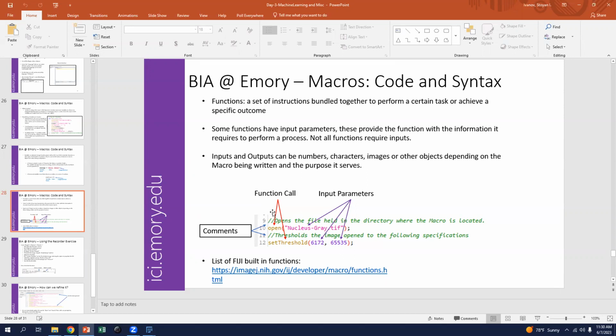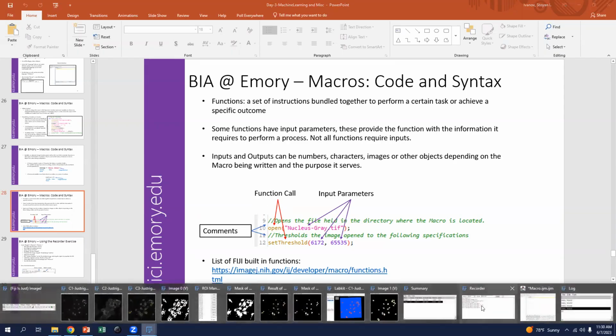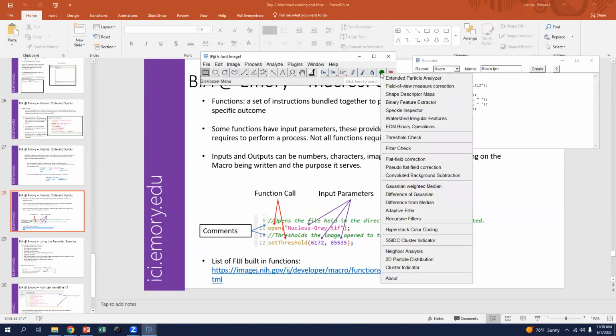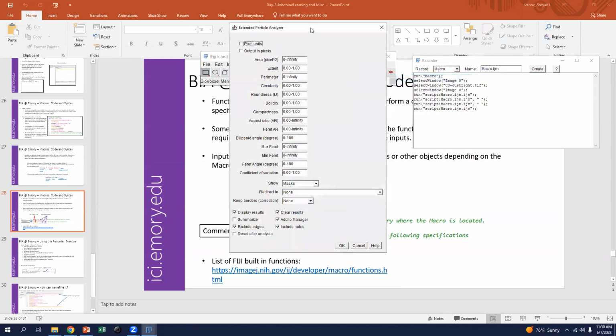Sometimes they'll be available, other times not. So you will have difficulty either finding out how to call it or being able to call it at all, because that information isn't accessible to you. And while we would want the recorder to record that, it does not always.